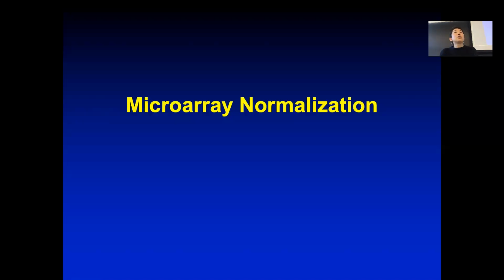Okay, once we start getting the microarray data, you get your CDF file, you get your cell file. The first thing we need to do is normalization. A very simple reason we need to normalize is situations like this.